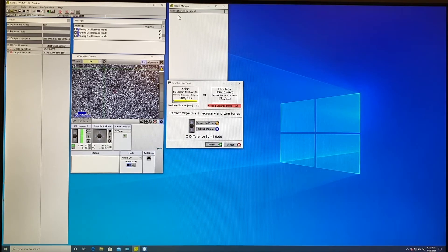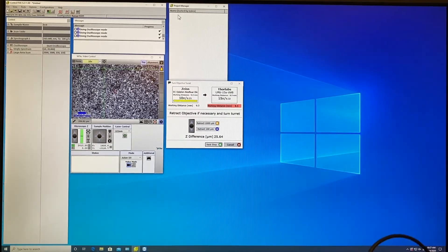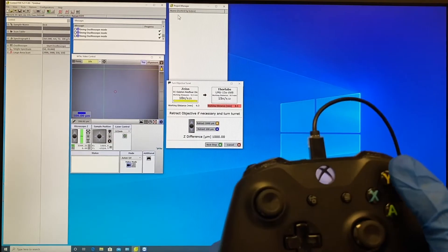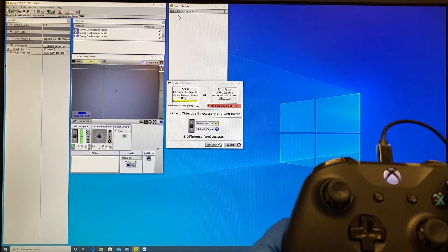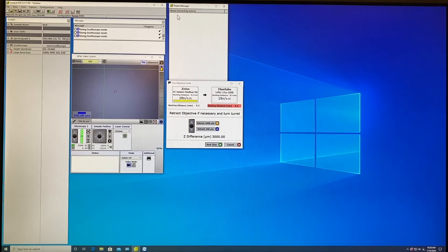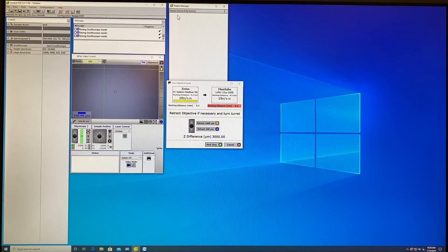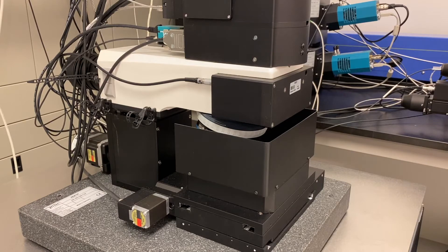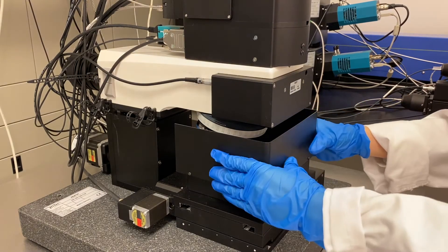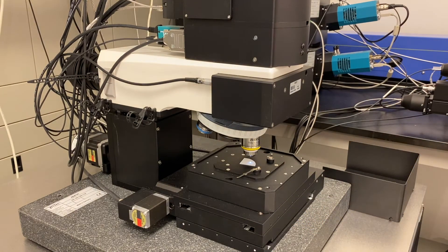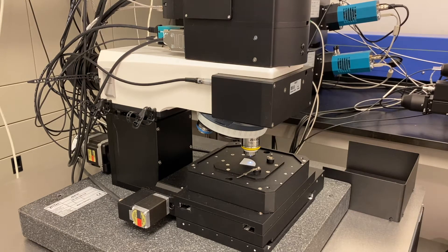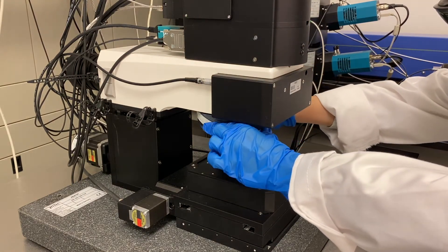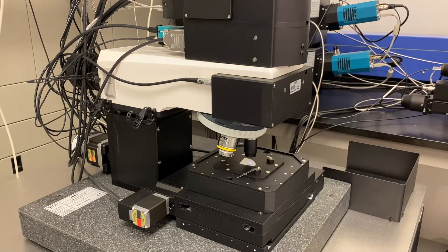We recommend you to retract three times by pressing Y button. This is one time, again, second time, and third time. After this you don't close this window. You go to the turret and turn to select 15x UV objective. To choose new objective you have to remove the safety lead gently. Then make sure the selected objective is 10x and then you move to the 15x UV objective. By holding the top part of the turret you turn it gently holding until the end.